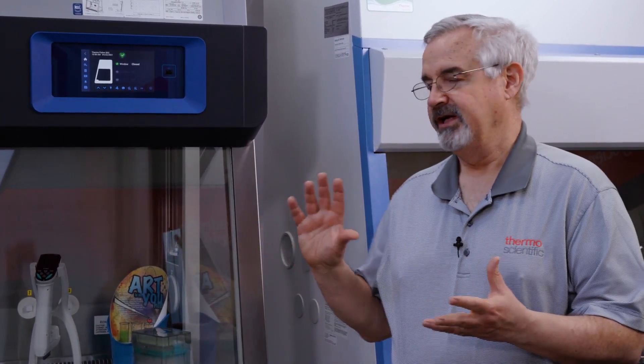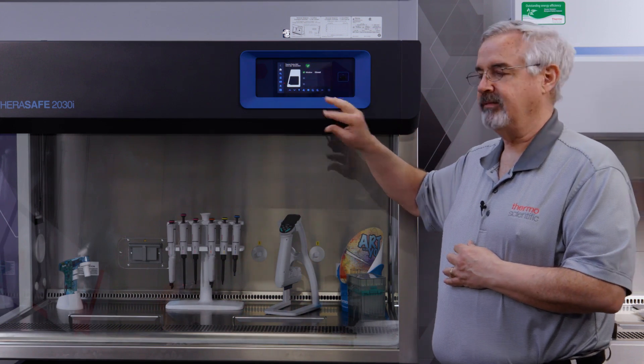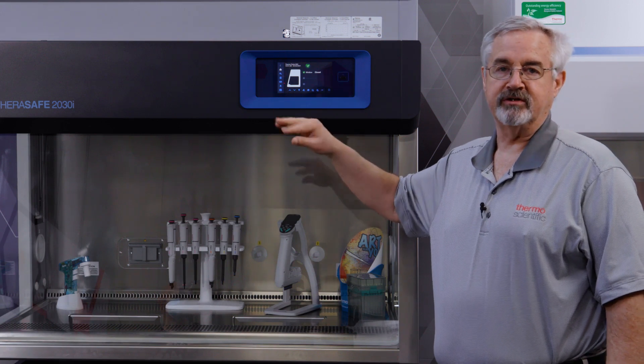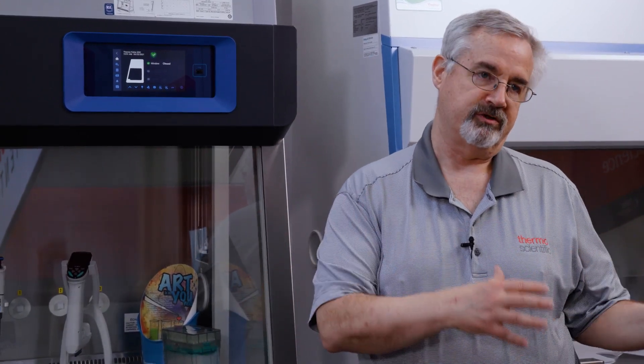This is a Class 2 Type A Biological Safety Cabinet, and one of the first things you may notice is that instead of the buttons or keys that you often see with a safety cabinet, we have a touchscreen. A lot of these icons in the general interface are familiar — it's the same iconography that we use in some of our centrifuges, freezers, and incubators to make it easier for laboratorians to move from one device to another.